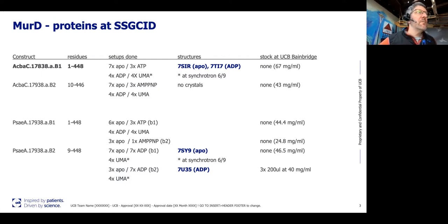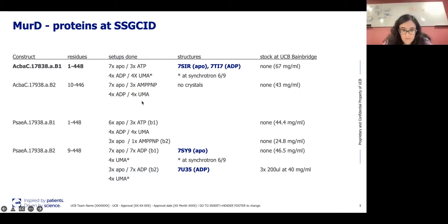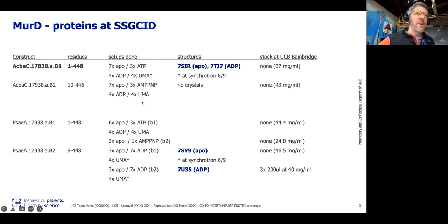The last setups with the UMA that you sent me, Laura, consume pretty much the rest of the protein. The good news is we got crystals very quickly, and they will be looked at tomorrow at APS. So hopefully tomorrow I will know more about what kind of crystals we have. That's great news.